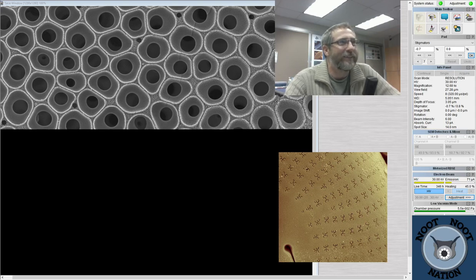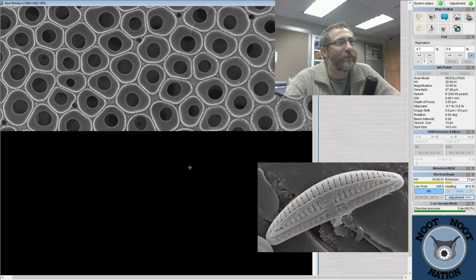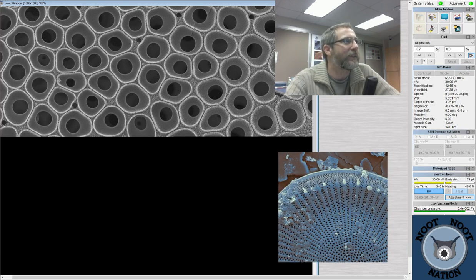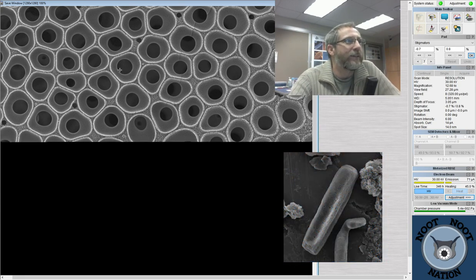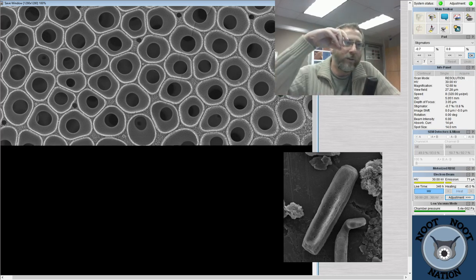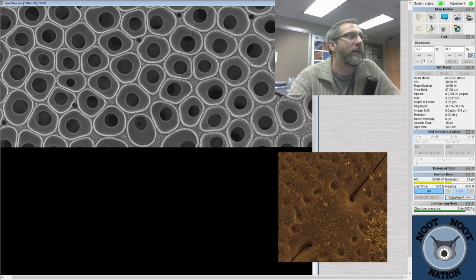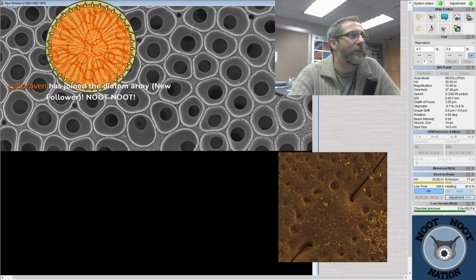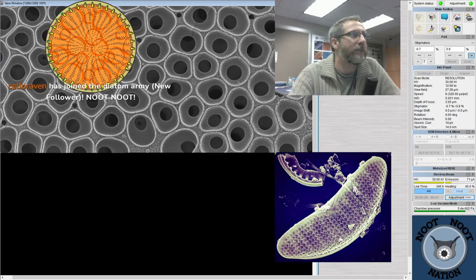Very large surface areas associated with them. But you can see the intricacies all over in here, even these little tiny bumps on the surface. There's a little sort of silica nodules that are in between these pieces where it's stuck a little bit of extra silica. And so just while we're looking at it, the larger hole that's here is the areole. That's the hole that they use to communicate with the outside world and push nutrients in and out through these. A lot of times the chloroplasts are associated with the areole on some level.